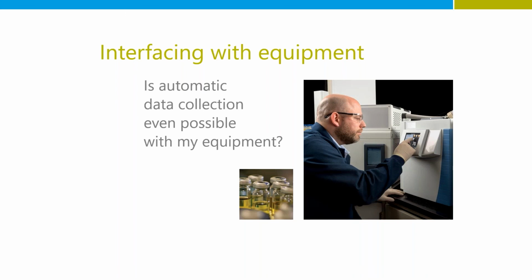So how do you know if your equipment can even do that? Well, you have to understand your equipment. I mean, you're in the business of laboratory test results, and it's more than just the data you're looking at, but you need to know your equipment. It reminds me of an example. I was in the Navy, and all the captains of the ships knew every little detail of the ship they were on, everything from the weapon systems that the ship might have, all the way down to the capacity of the oven and how that worked.